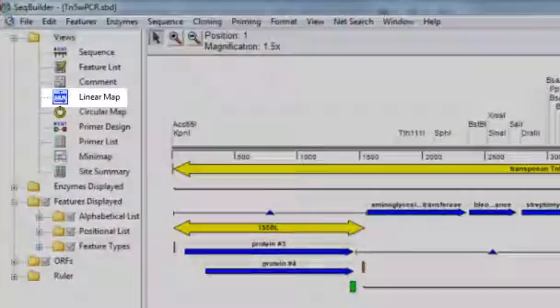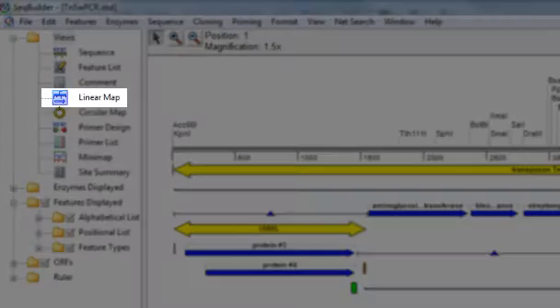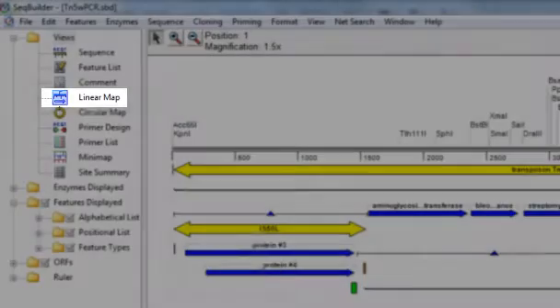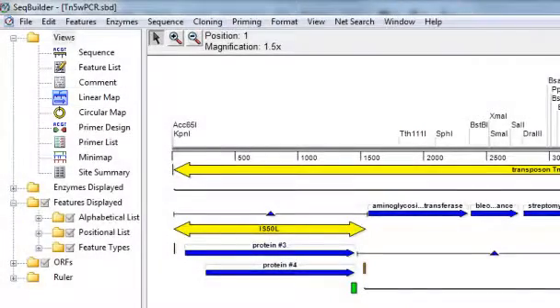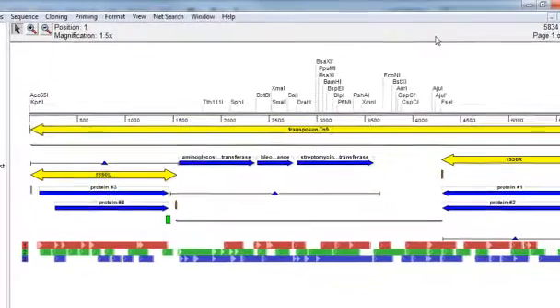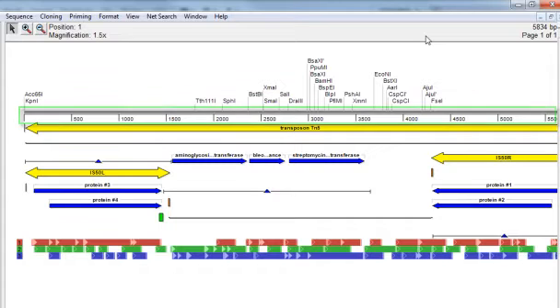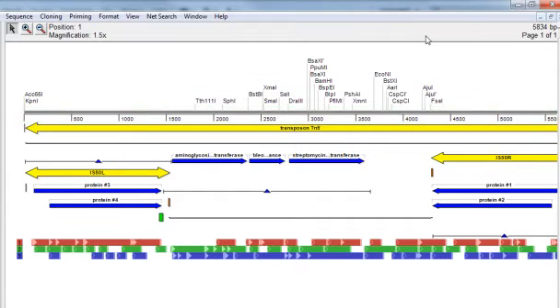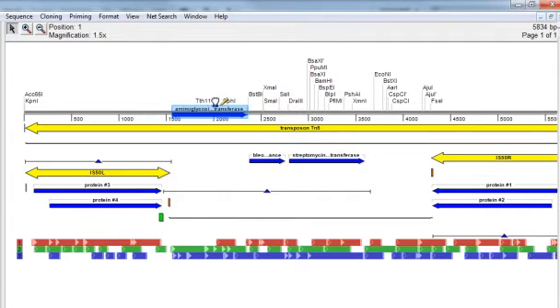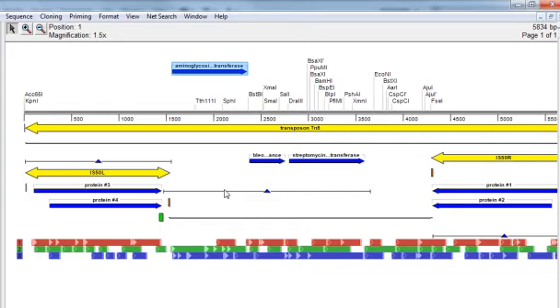The Linear Map View will display a linear map of your nucleotide sequence. From here you can show enzymes, ORFs, and features against the ruler that represents your sequence. To reposition items on the map, first double click the item to select it, and then you can click and drag it to where you want it to be displayed.